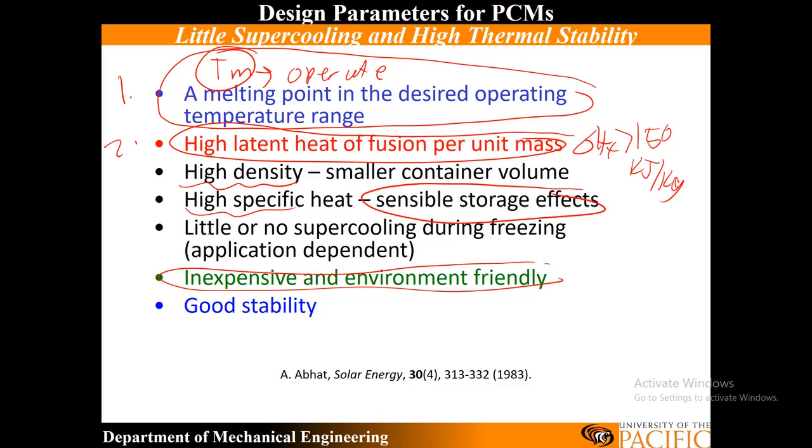Another very important parameter is supercooling. Oftentimes, we know that ice should melt at 0 degrees C, and solidify at the same temperature. But oftentimes you'll see, and we're going to produce plots like this, where we measure the heat flow versus temperature. If this is endo and exo, we're going to heat and melt, and then solidify, and you're going to see a difference in the melting and the freezing point here. This is due to kinetic behavior.